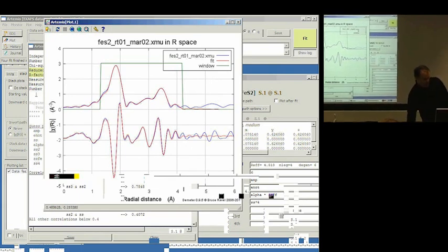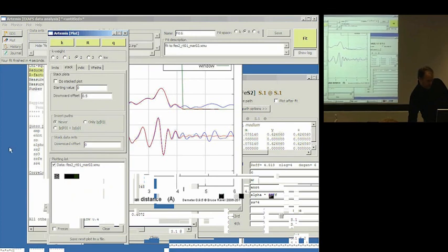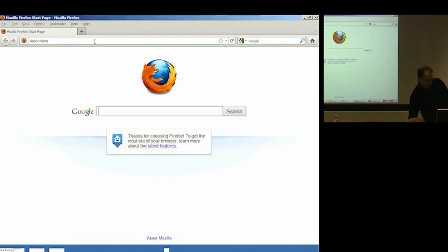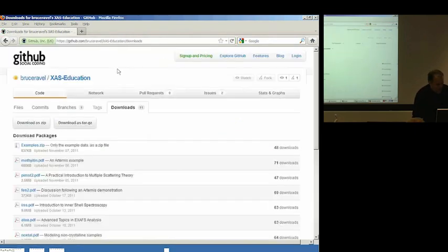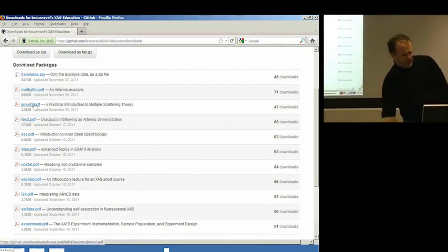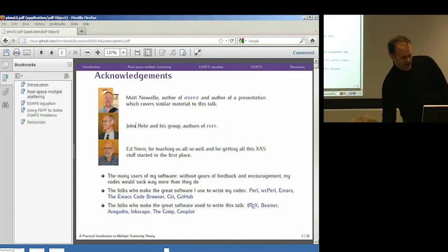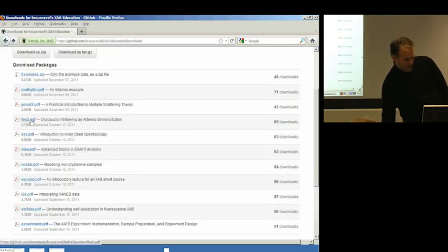Let me just show one more thing, and then I'm going to call it quits for the moment. Is that happening? Yeah, there we go. Wow. You keep asking me that. So let's go back to my GitHub page. One of the presentations that I prepared is really just a supplement to this demo. This isn't really a presentation, but it's a PDF file, and you can grab it and look at it. Let me just point out a few things that I have in here. I clicked on the wrong file, so let me go back and click on the correct file. Works better that way.